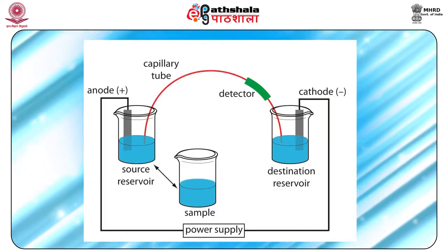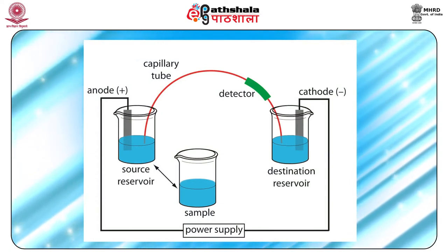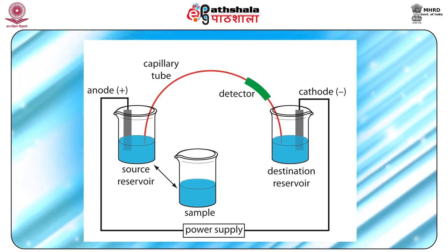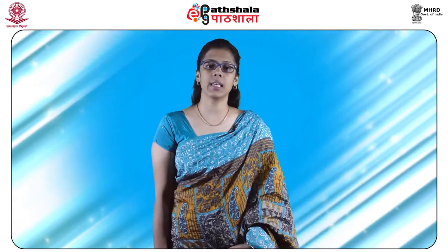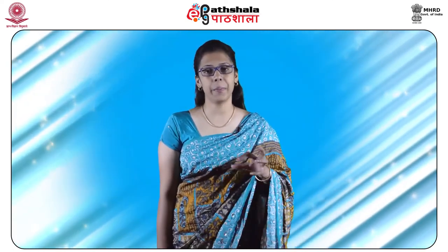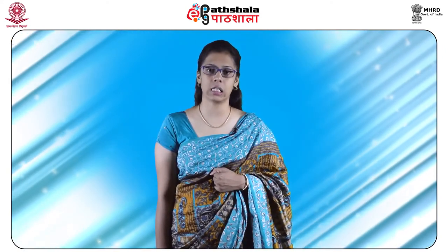In CE methods, analytes migrate through the electrolyte solution under the influence of an electric field. Analytes can be separated according to ionic mobility. Additionally, they may be concentrated by means of gradients in conductivity and pH. Its forensic application was first given by Weinberger and Leroy. Capillary electrophoresis is so attractive for forensic analysis for its minimal sample preparation, low reagent use and waste production, and its separation power, followed by a quick analysis.